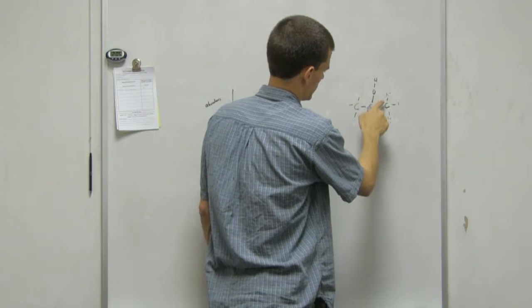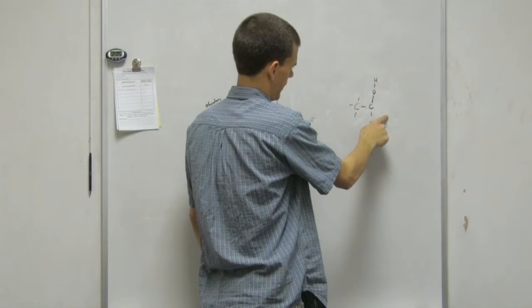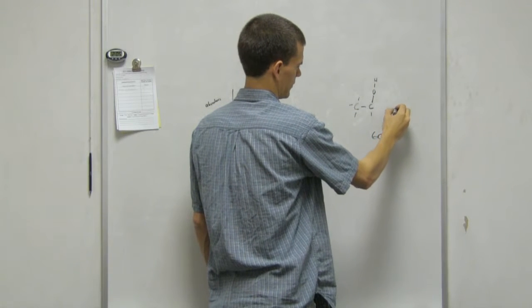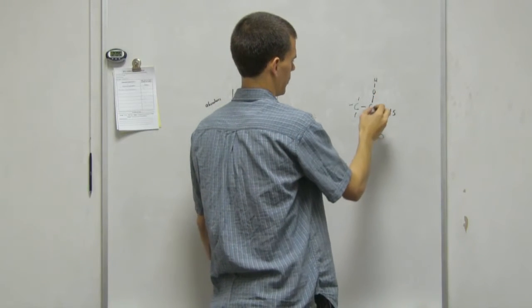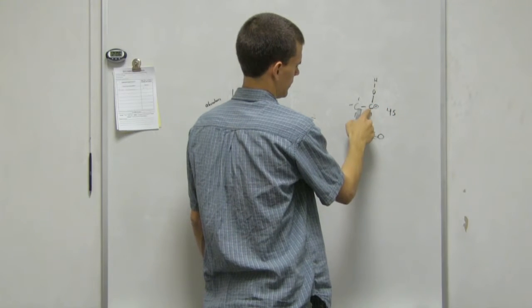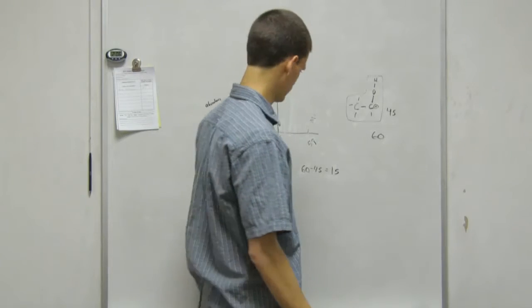So what happens is this tallest peak right here was made because this chunk fell off. Right. And so you went from the mass of the whole thing being 60, and now the mass of just this is 45. Oh, okay. I see. So now it just wants you to draw that and put the positive charge, because this atom, because it lost those electrons, now has a positive charge on it. Oh, okay. So it's just asking you to draw this chunk. That makes sense.